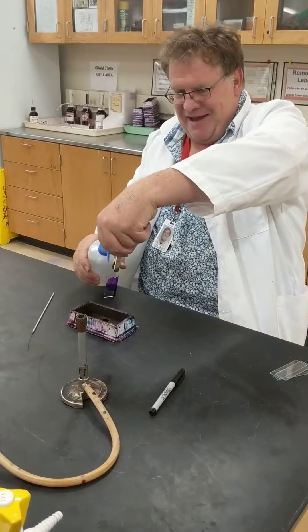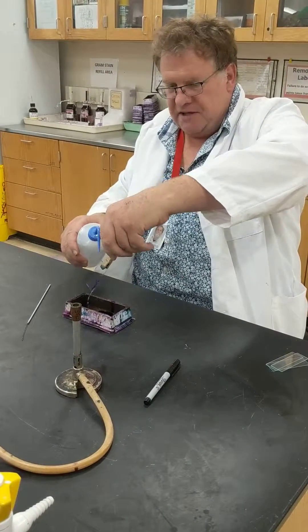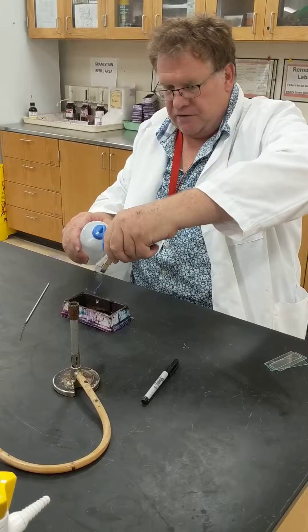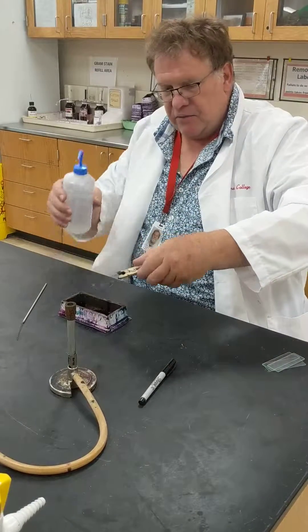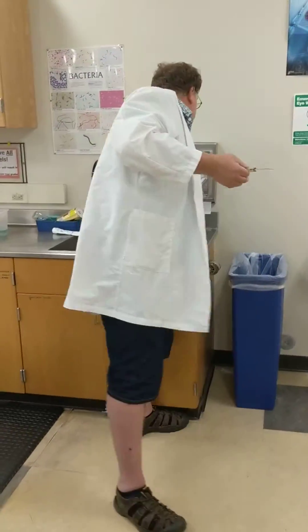You're going to use your distilled water and just rinse off the stain. You want the water to kind of roll over your slide — you're not necessarily squirting off the stain.